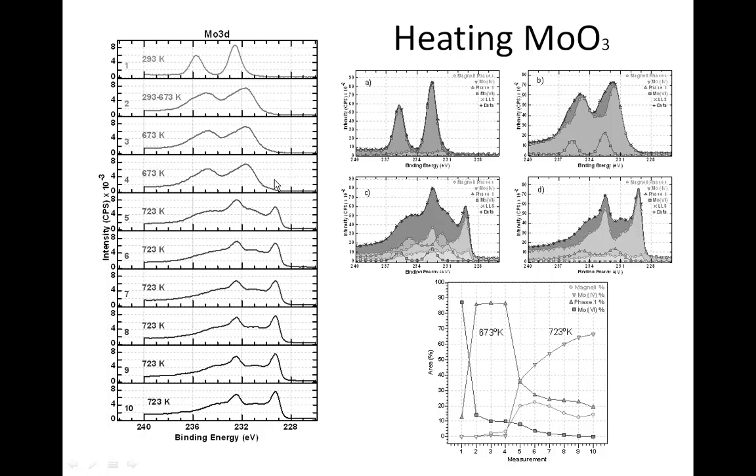When we go above to 450 degrees Celsius, then we end up with the original 2 shapes plus additional shapes that are required to fit these data. So this gives us some kind of handle by which we can understand how molybdenum trioxide in a thin film may transform into what we believe to be molybdenum dioxide.